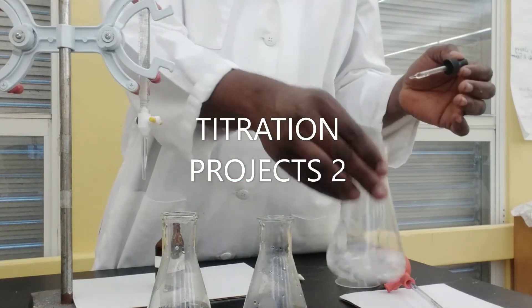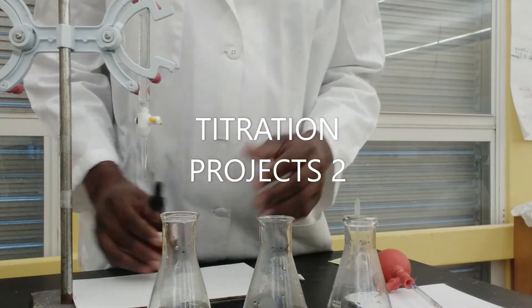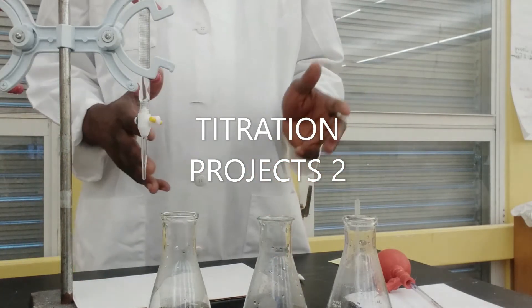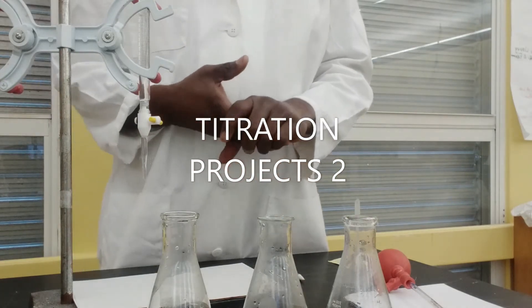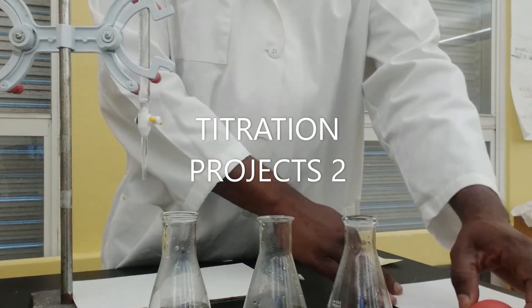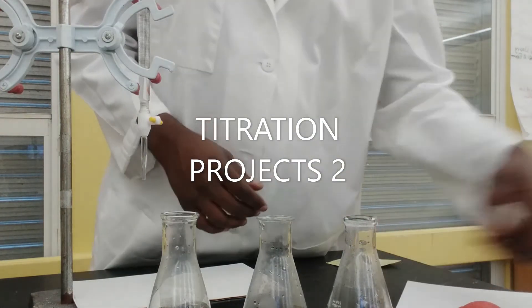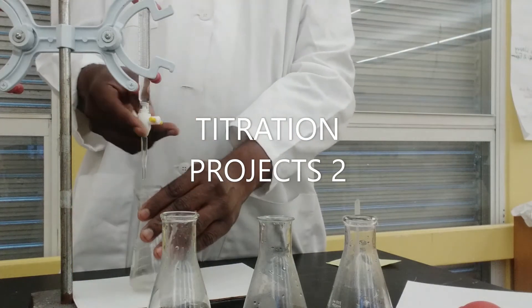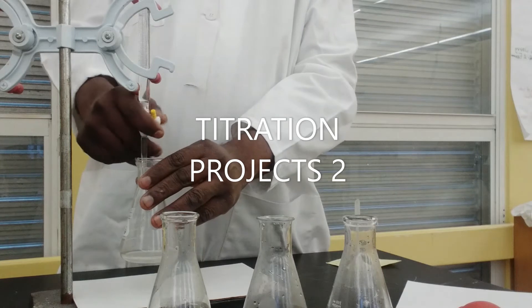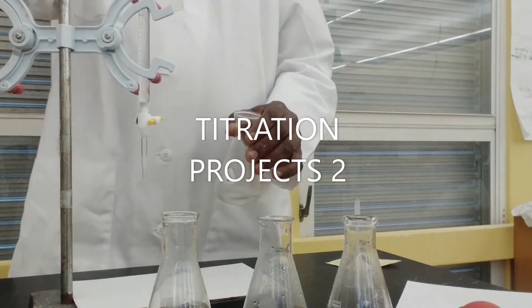The whole idea of using phenolphthalein is to help tell us when we've reached what we refer to as the end point — that is, the point where we relatively have equimolar quantities of the acid and the base, and also to indicate that our reaction is complete. Right now I'm going to note the volume at which I'm starting my first titration.